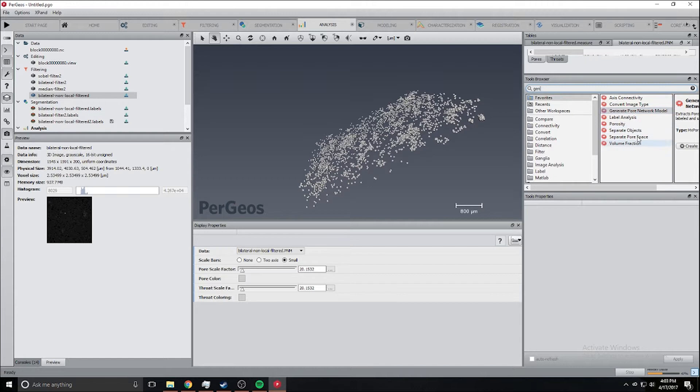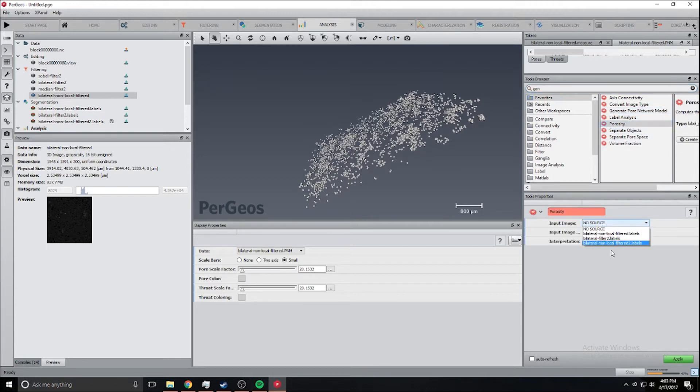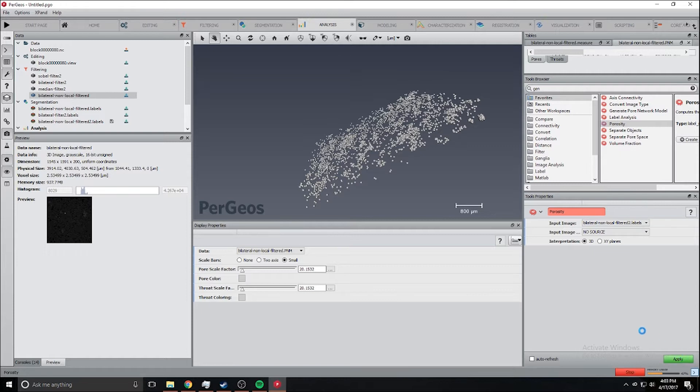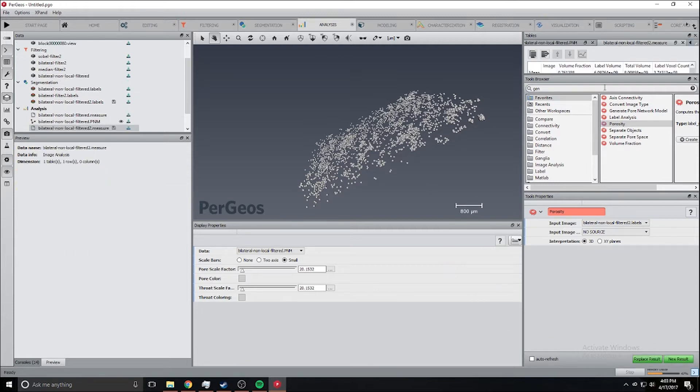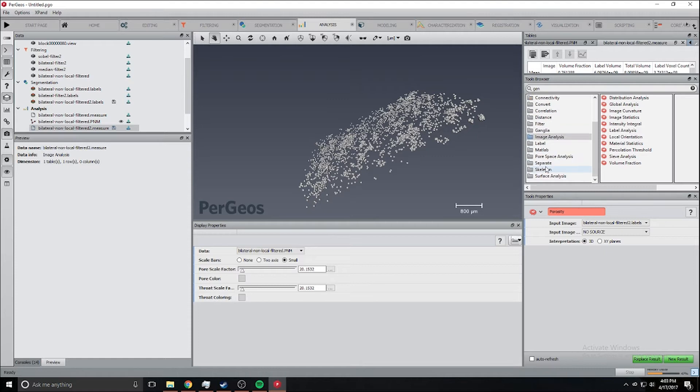To calculate the porosity we're going to select the input image and click apply. That will calculate the porosity and you can find all the pore space analysis.